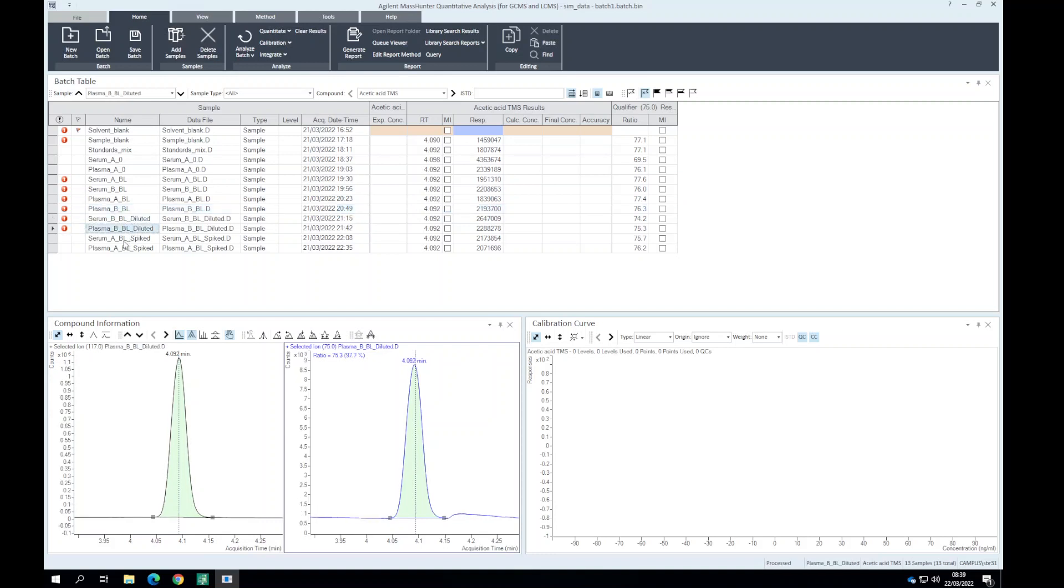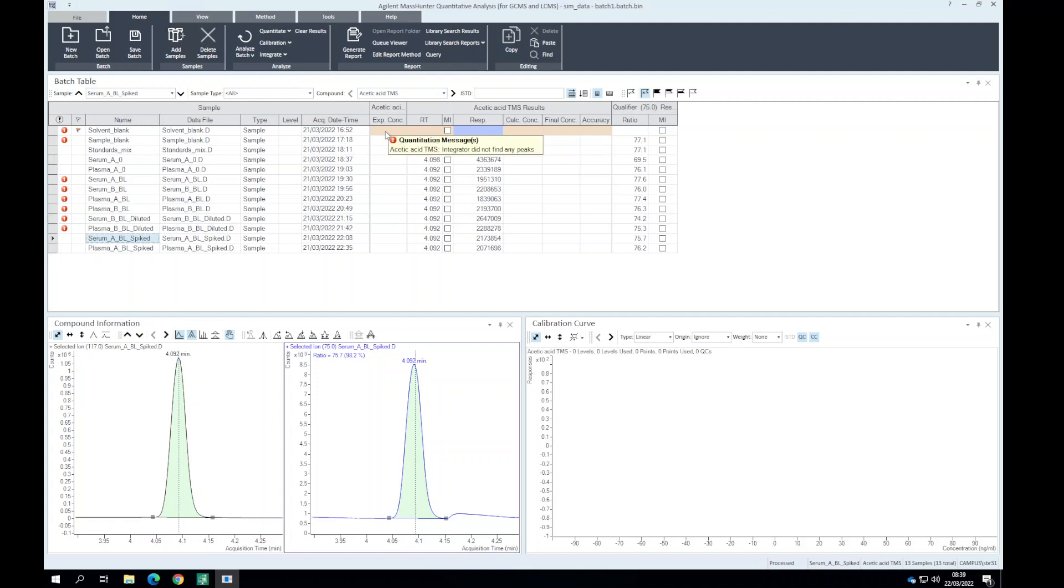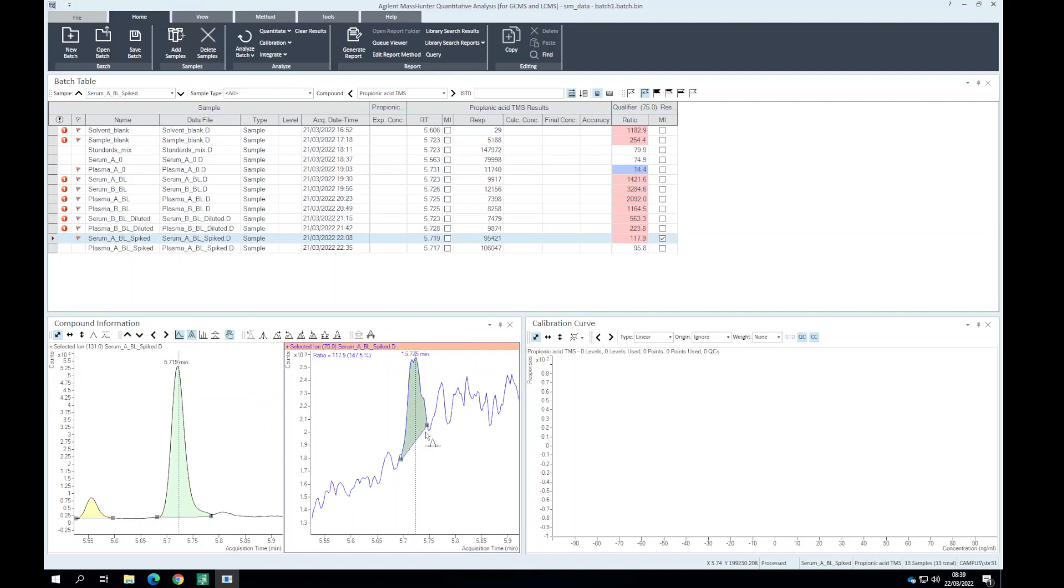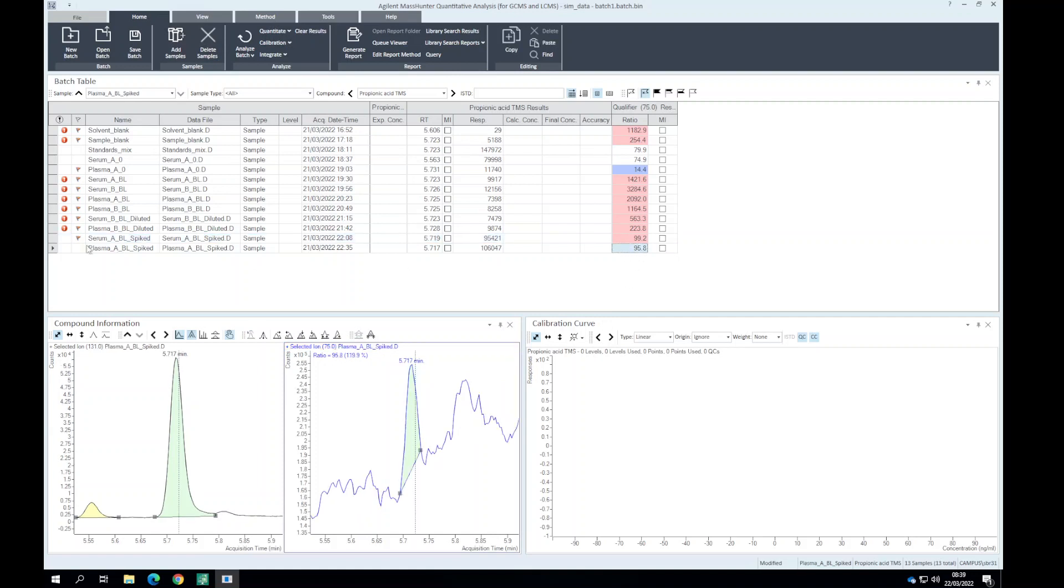We can see here for the serum spikes where there's been the addition of our acetic acid, propionic acid and butyric acid. We can see the qualifier ratios are okay at this level. When we go over to the serum spike for propionic acid we can see there's a slight deviation and it could be related to how this qualifier ion is being integrated. We can either manually integrate or allow the automated integration to take over.